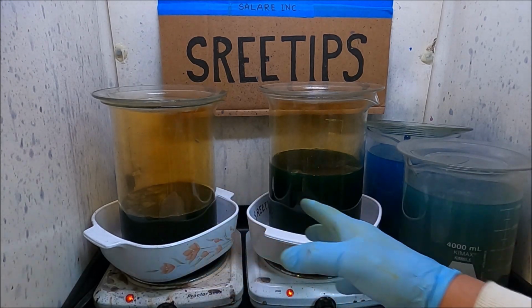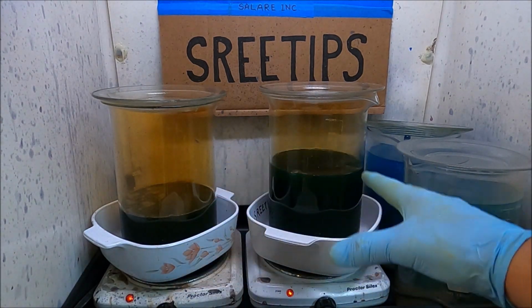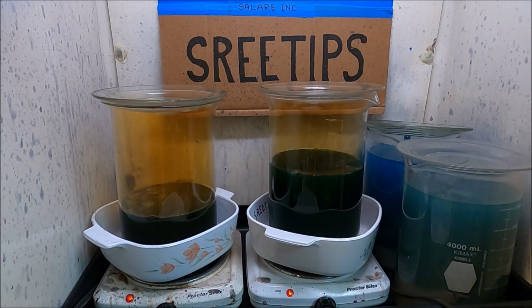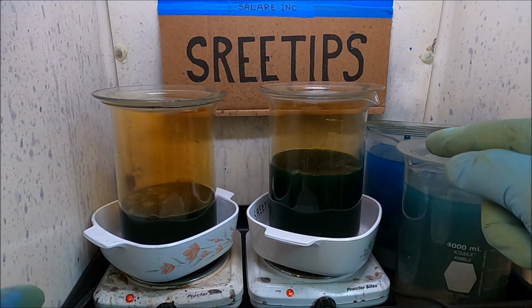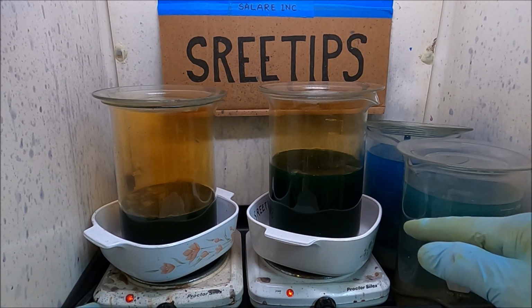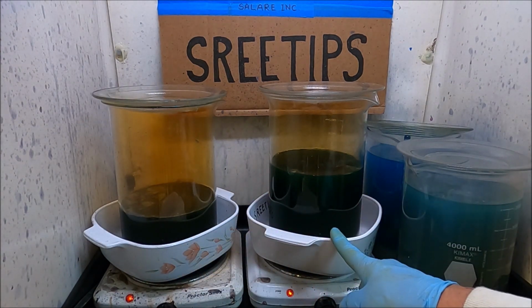And what I'm going to do now is I've cranked the heat on both of these, and I'm going to let these boil until all the fumes clear up in here. And then once the fumes clear up pretty good, I'll turn the heat off and we'll let these solutions cool off, settle out, and then we'll draw off the solutions in here.